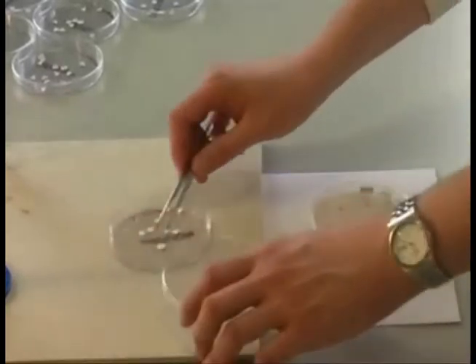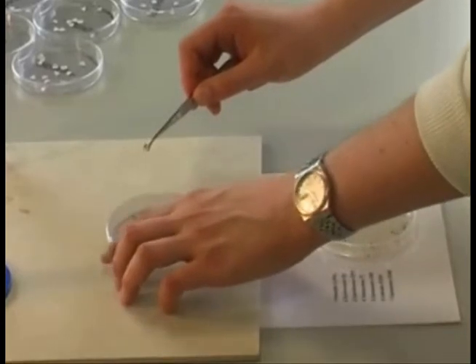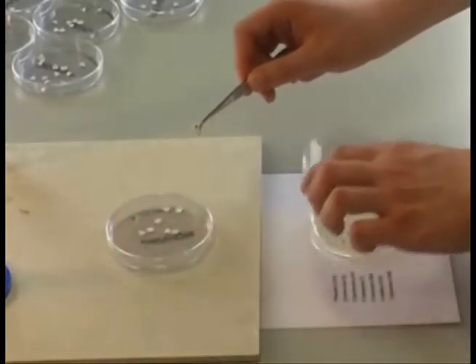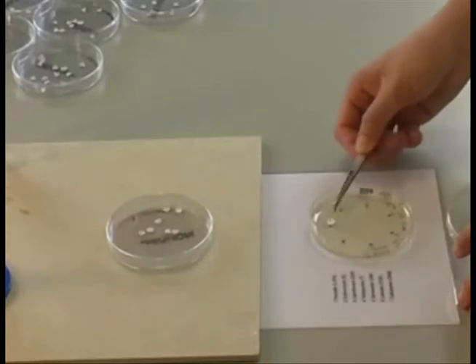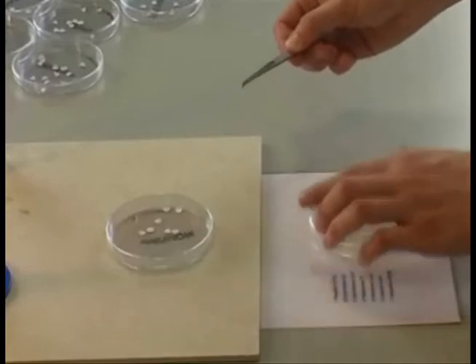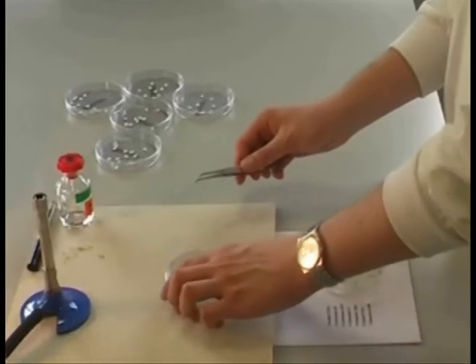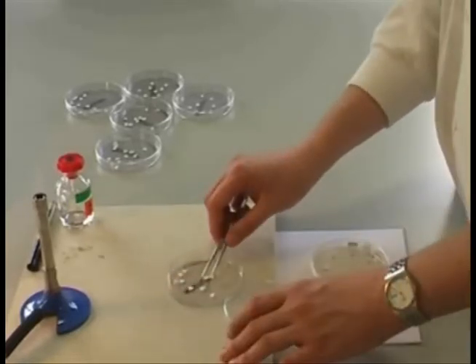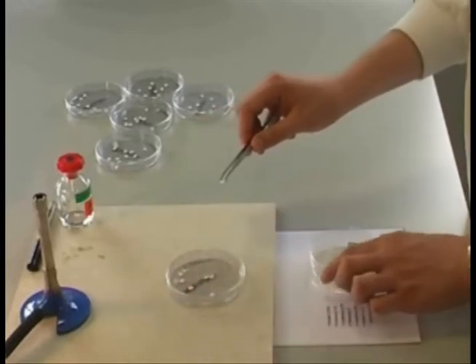Select the appropriate antibiotic disc from the stock plates located on your bench. Peck a disc up with sterile tweezers and place it on your streaked plate. Gently tap it onto the agar. Try to place the discs according to the guide which has been made available, and don't forget to re-sterilise your tweezers. The remainder of this video will demonstrate how you should aim to build up your set of antibiotic discs on the streaked plate, according to the guide.